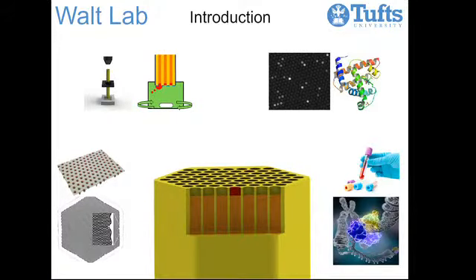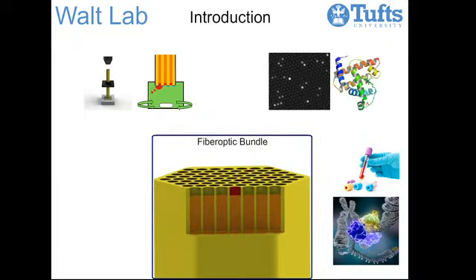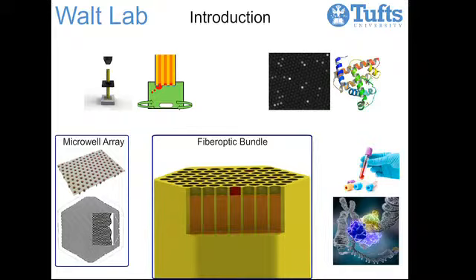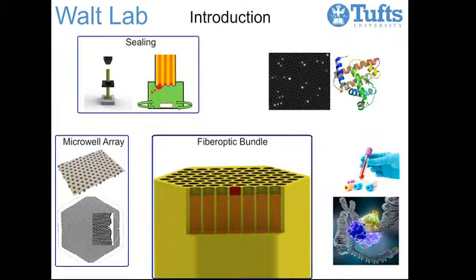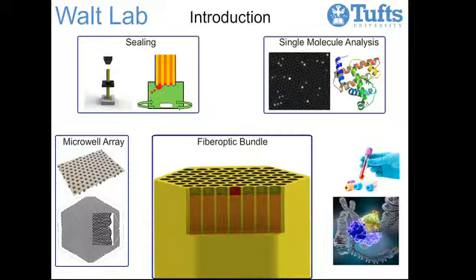In this video, we will give an overview of the research performed in the lab of Professor David Walt at Tufts University. We will describe the basics of fiber optics, the fabrication of microwell arrays using fiber optic bundles, how we seal the microwells, and how we use this platform to analyze single molecules. Finally, we will discuss how analyzing single molecules helps give us important information in fields such as cancer diagnostics and fundamental enzyme studies.